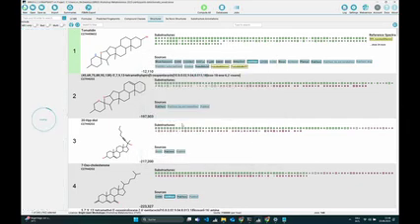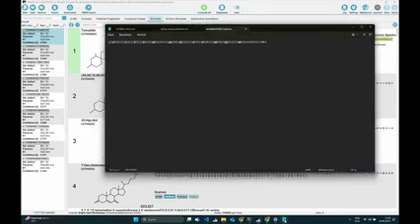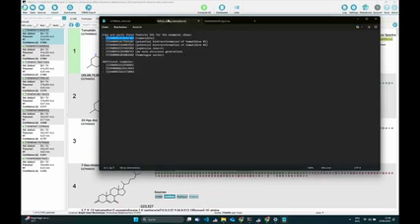This will take a little bit of time, but not too long. What it did now is filter our feature list by only features where we have a structure hit in this tomatidine biotransformer custom database. These should now be 9 hits, and I will now go to one other example. If you want to copy paste, this will be a second one, but don't worry, the following examples I will show much more briefly.